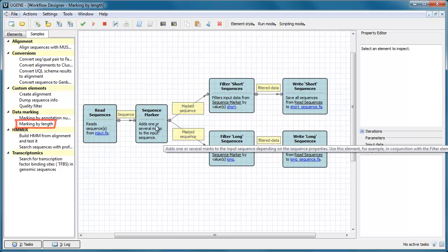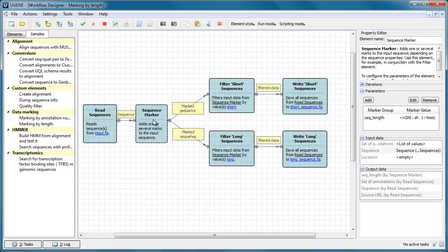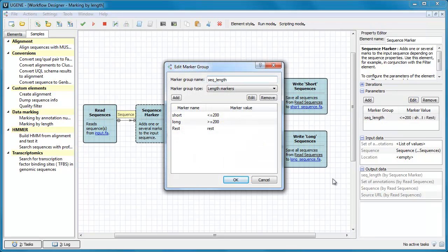The Sequence Marker element allows one to add one or several marks to an input sequence. The marks may depend, for example, on the input sequence length or on the count of the sequence annotations.